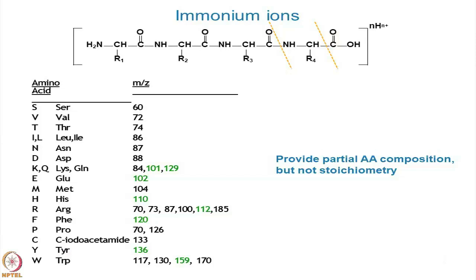From a terminology standpoint, that's a distinction between the manufacturers. If you have a QTOF instrument, say from SciEx or from Agilent or Bruker, they might call that fragmentation technique CID. That fragmentation is exactly the same thing as what Thermo calls HCD. The reason is that before Thermo created the current instruments, they had ion trap fragmentation that was resonance excitation, and they called that CID. So they had to have another name for when they did it the same way as other people.